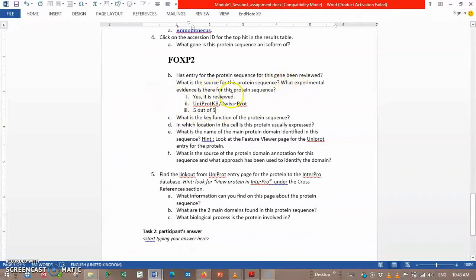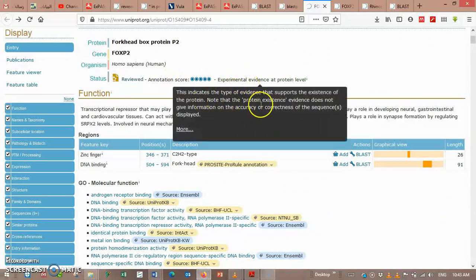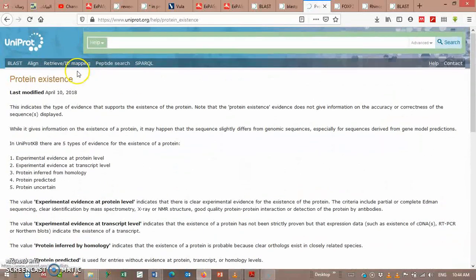What experimental evidence is there for this protein sequence? The experimental evidence annotated score is 5 of 5. There are five types of evidence: evidence at protein level, evidence at transcript level, inferred from homology, predicted, and uncertain. If a protein is predicted, inferred, or uncertain, then the protein existence is not a strong indicator of the accuracy of this protein.